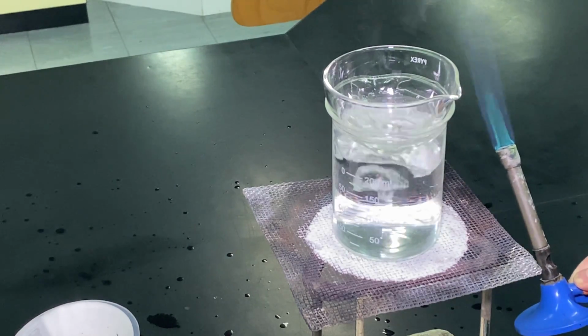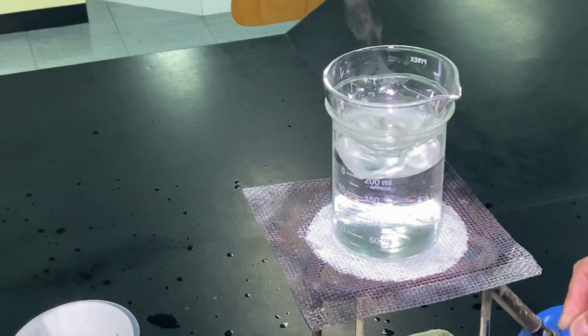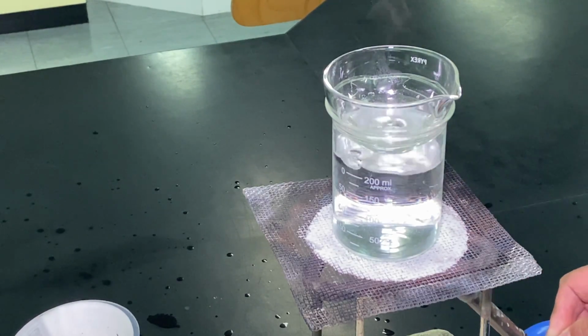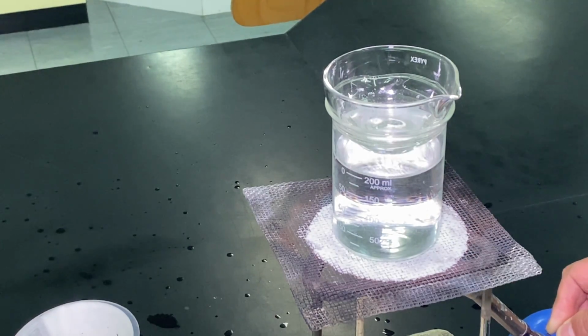Because the water and the sodium chloride are not chemically combined together. And if they're not chemically combined together, we can separate them using a physical process, which is what I'm doing now.